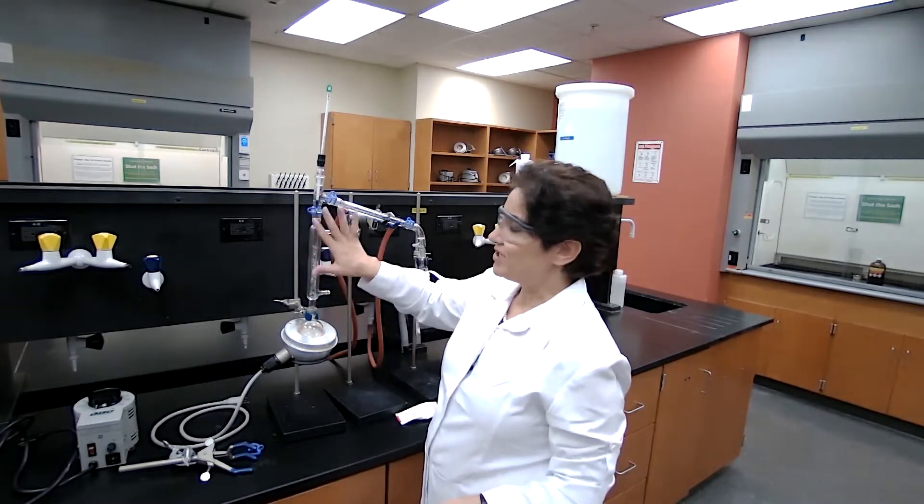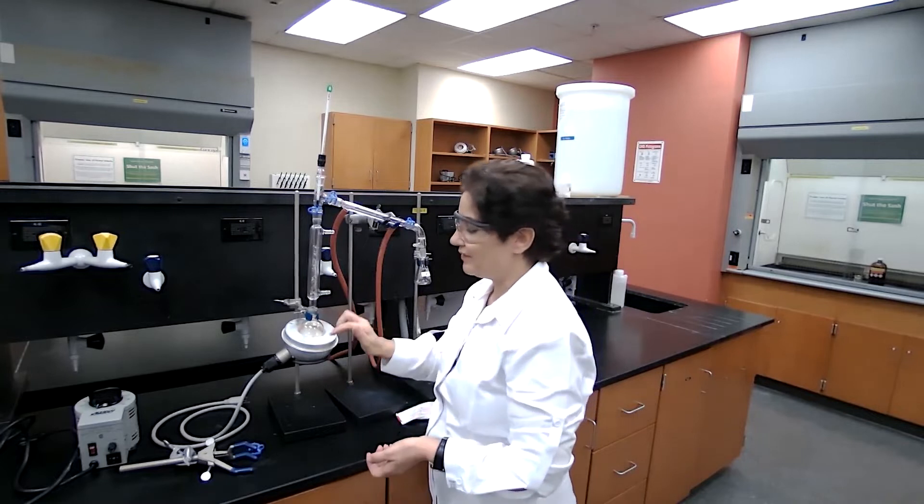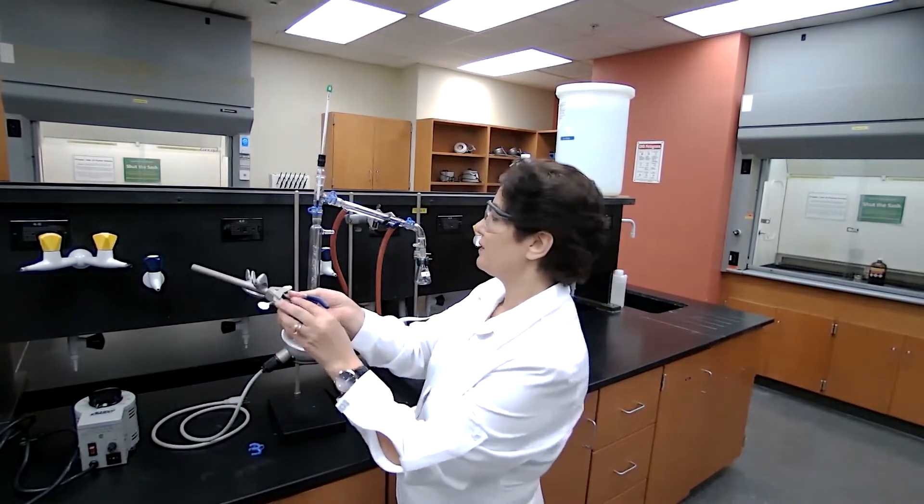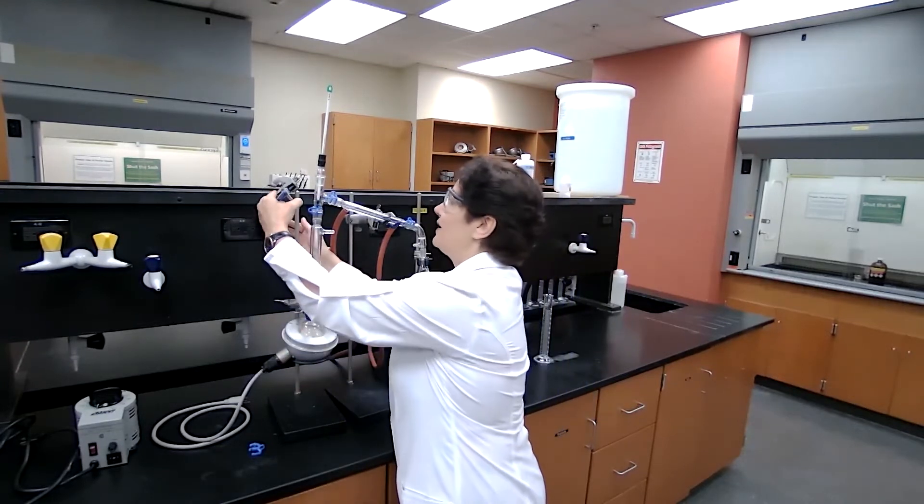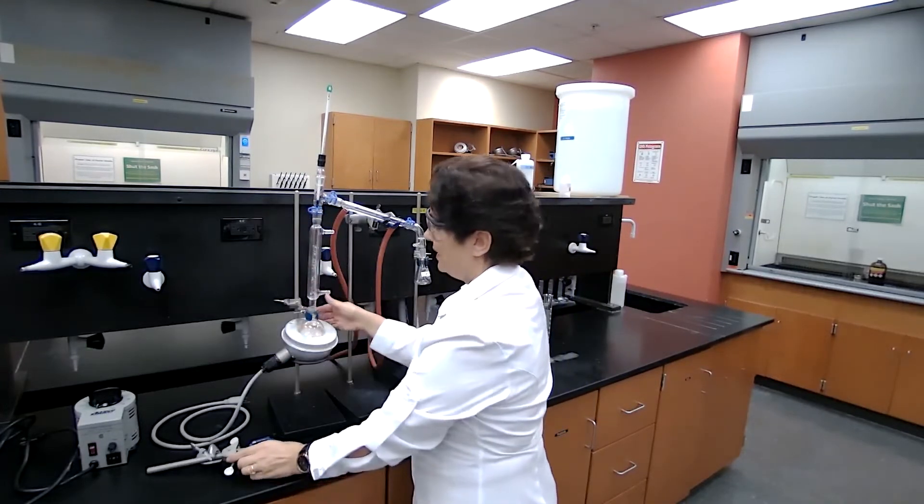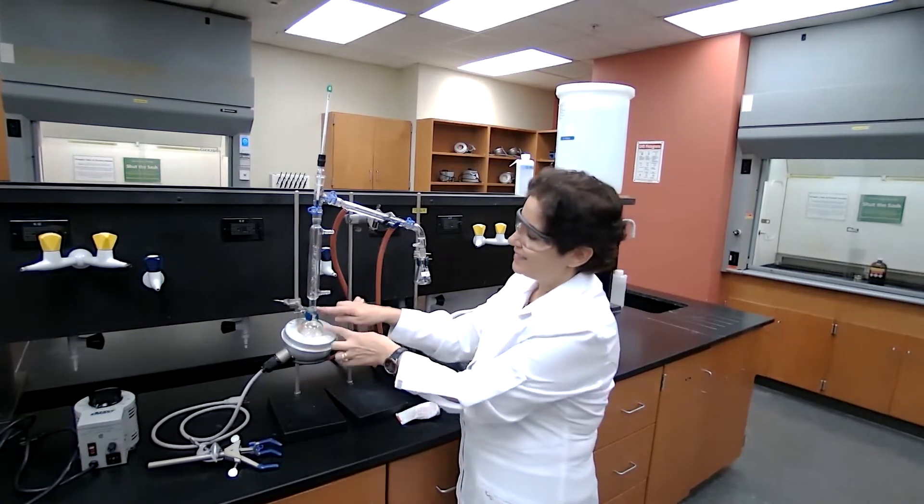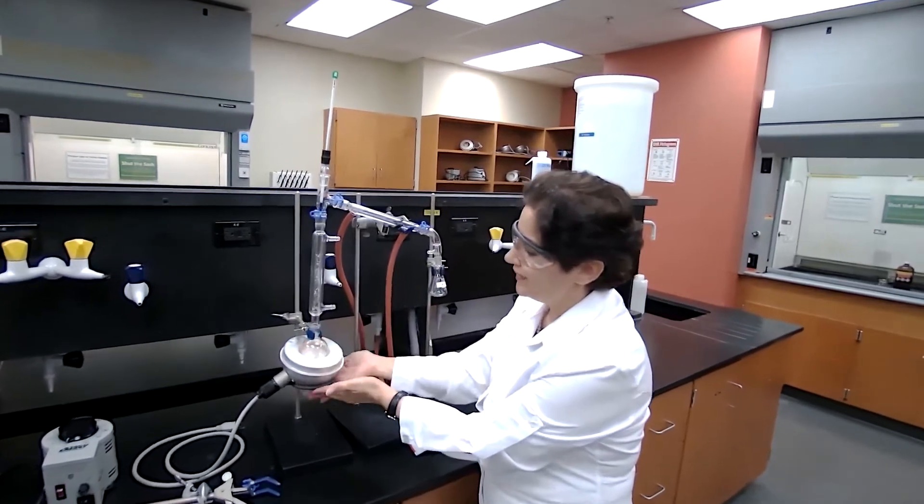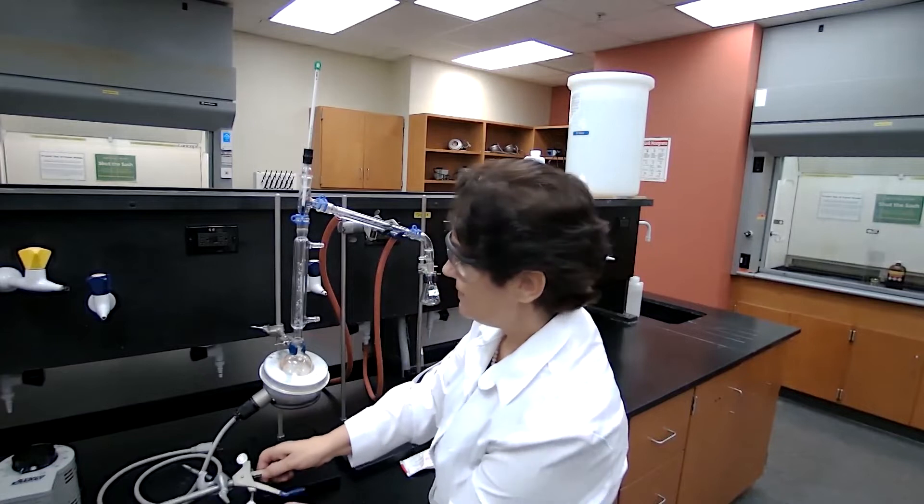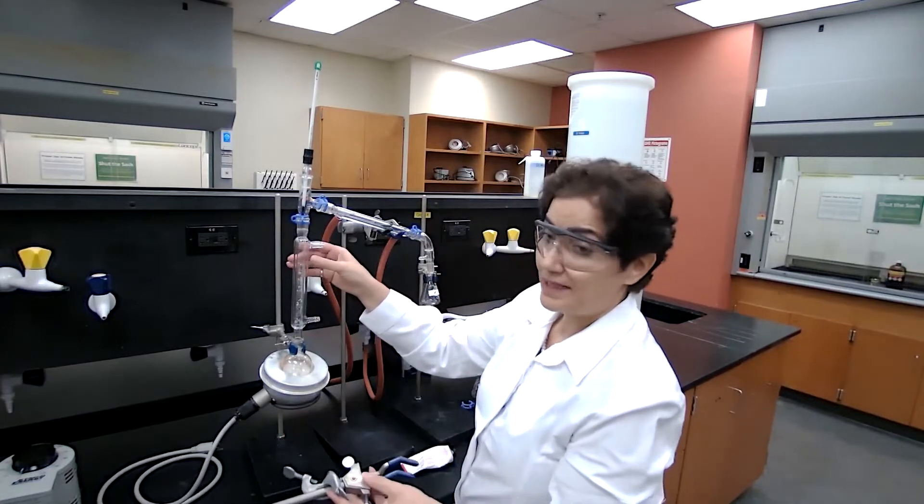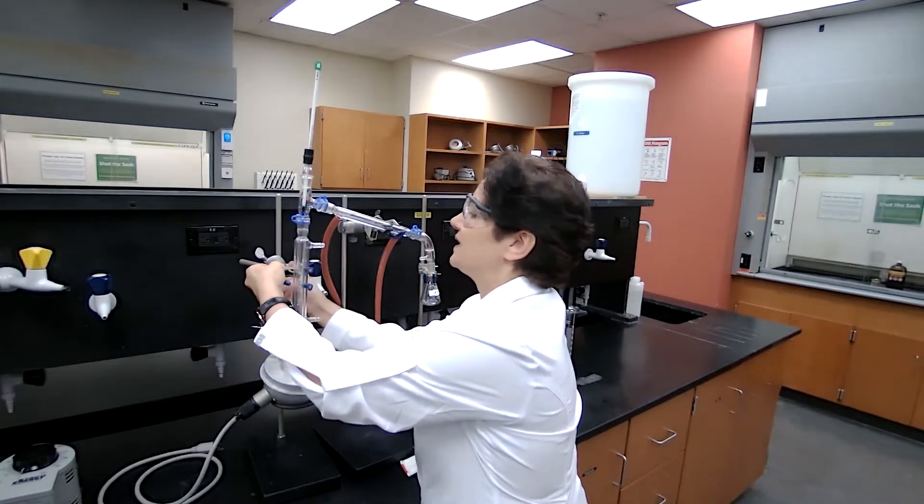When you insert the fractionating column between the distillation head and the boiling flask, you want to make sure to use a three-finger clamp and support this with the clamp. If you don't use it, as soon as you open and lower the ring trying to get the flask out to add the chemicals, it will disconnect and drops and breaks.